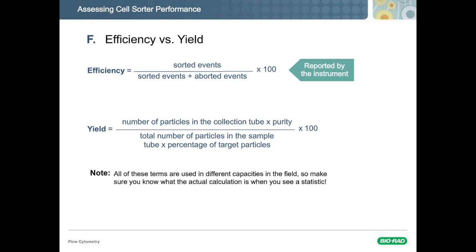And the best way, again, is to really get down into taking a sample, pipetting it into 2 different tubes, running them on instruments, and then using a third instrument to look at the actual sort collection on the output. And when you do that, that's a much better way to assess comparative efficiencies, comparative yields, comparative recoveries, because you've taken the software fudge factors out. There's a lot of different ways the software has to try to come up with these numbers, and some of them are even configurable, like I said, and that can just make it very, very tricky.